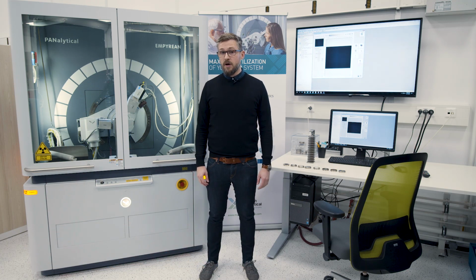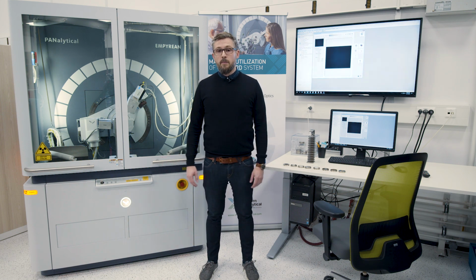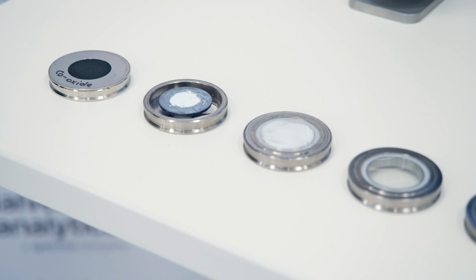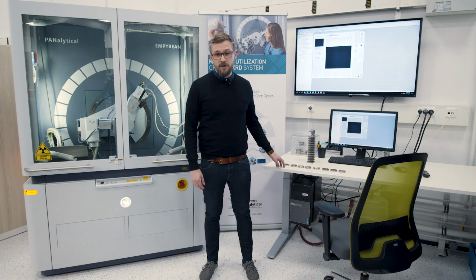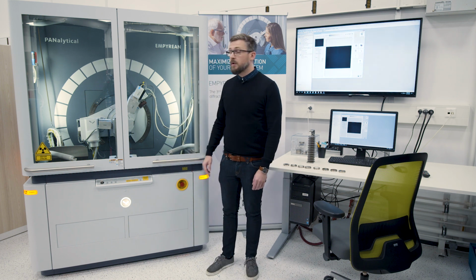In today's video, I would like to demonstrate to you the functionality of our new Empyrean Series 3 with the new multi-core diffraction setup. I'm going to show you the functionality by demonstrating it on a sequence of different measurements on very different sample types, applying different X-ray diffraction applications on each and every one of them. And for this, we're going to be using our new Empyrean Series 3.